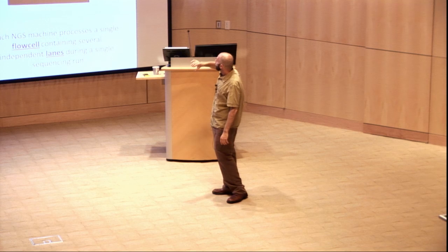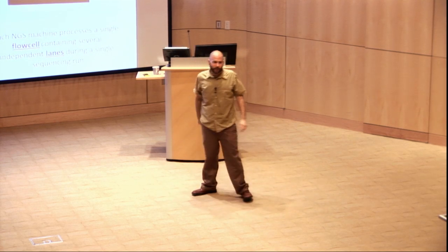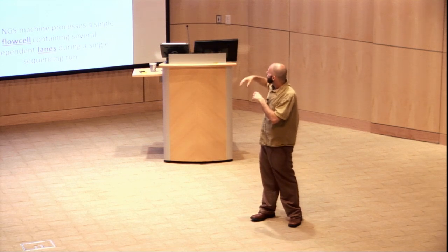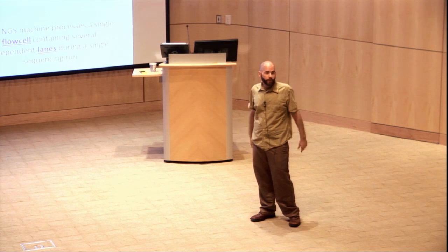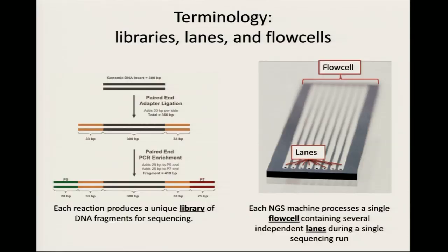But the other thing is there can be errors specific to the lane. So maybe someone sneezed on the slide or something, and that sneeze just hit one of the lanes, right? And so now you have errors in just that one lane that aren't affecting the other lanes. Building an individual error model per lane is how you're able to capture that kind of variation. Does that make sense? The divisions there? Okay. So the actual physical device used in the sequencing is what gives rise to the divisions of the error, to the covariation of the error.